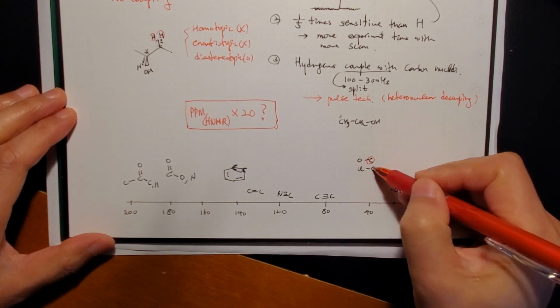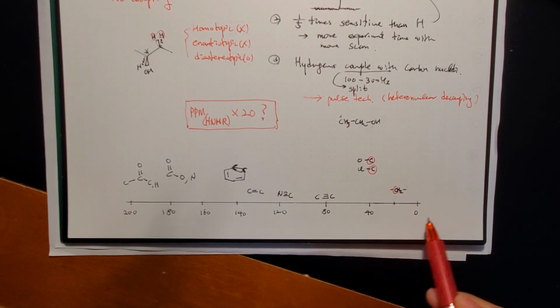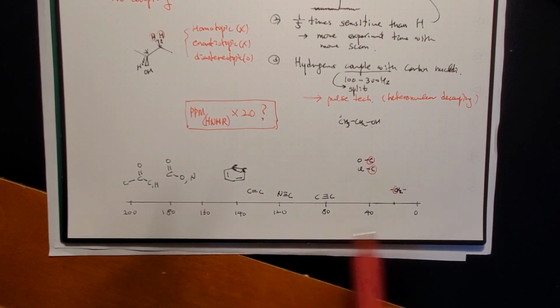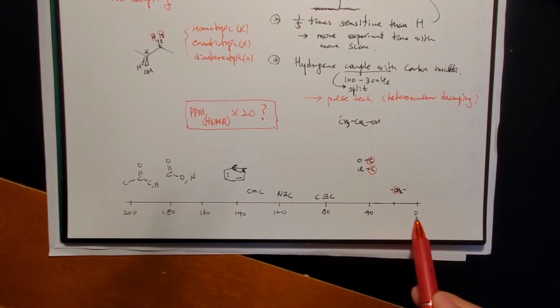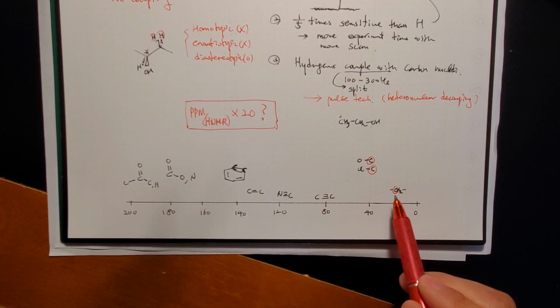Those are the carbons that you are trying to detect. Our first block, 0 to 40. It was 0 to 4, but now it's about 10 times. 0 to 40. They can easily go over. Depends on what you have, but roughly speaking.